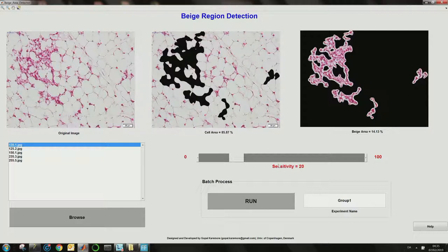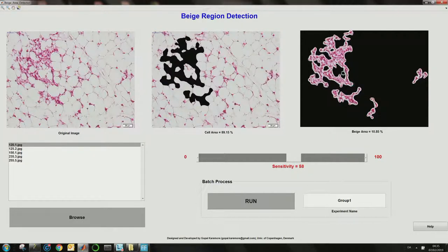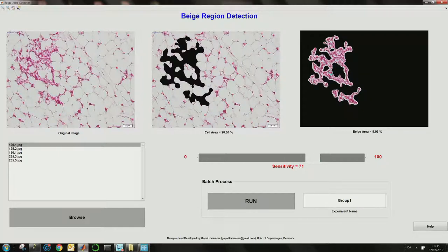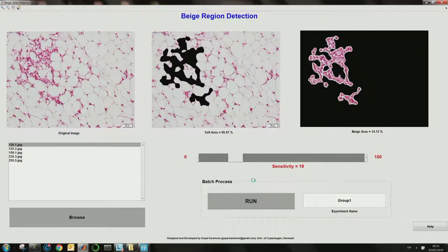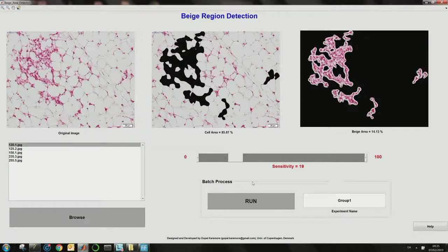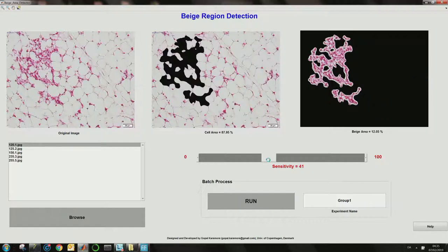The user can select different sensitivity thresholds, which can vary from 0 to 100 by sliding through the slider, and this will reflect in the beige area calculation. If you go more to the right, the beige area decreases but you are more confident about the beige area. Going left gives more beige area but with a wider confidence interval.